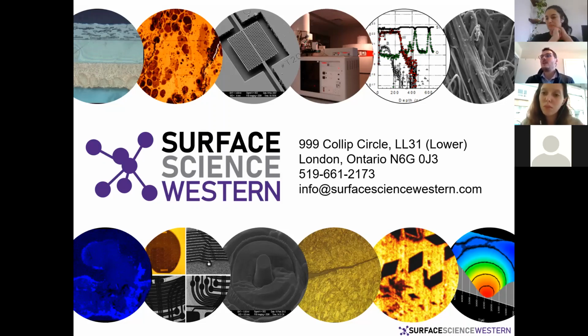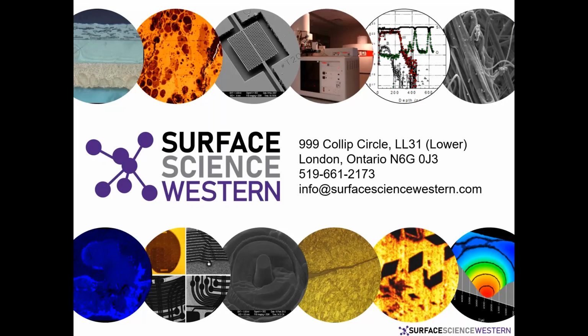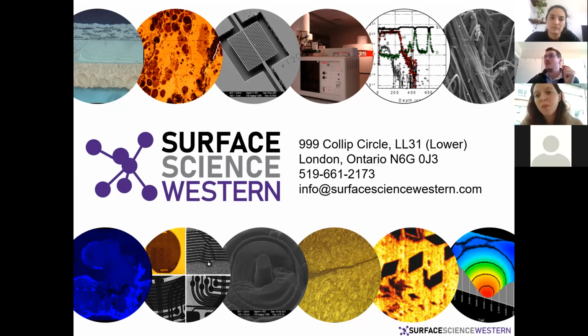So when people try to quantify and say, well, I've got iron 2 and iron 3, I don't believe it very much unless they are proving it based on spectra, because I've just shown the oxides and hydroxides, but there are carbonates, mixed metal oxides, mixed sulfates, all those other things. They'll all have different structure within the iron. Just like nickel, where you could see it because it was really different. All those different things had different peak shapes. When people take systems with a mix of oxides, metals, and sulfates and just say they've got iron 2 and iron 3, I don't believe it, because that could be just iron 2 with more satellite structure from a specific species. They try to simplify it when it's not simple.